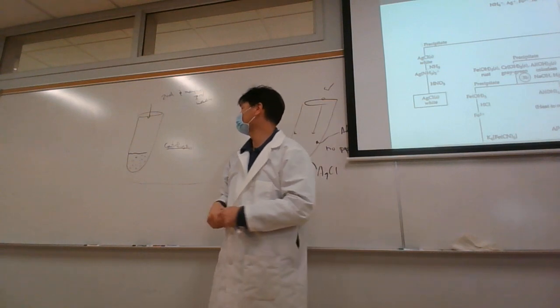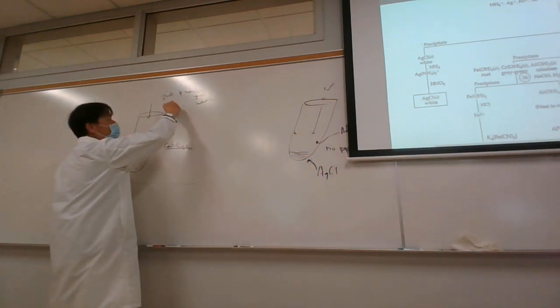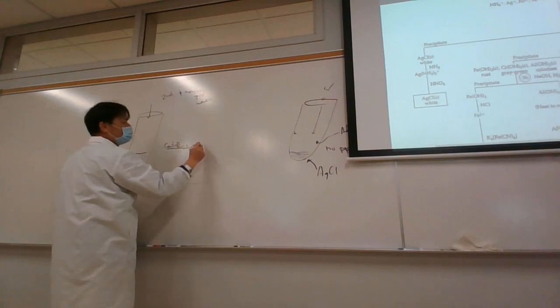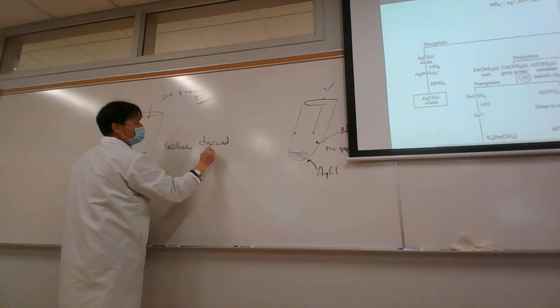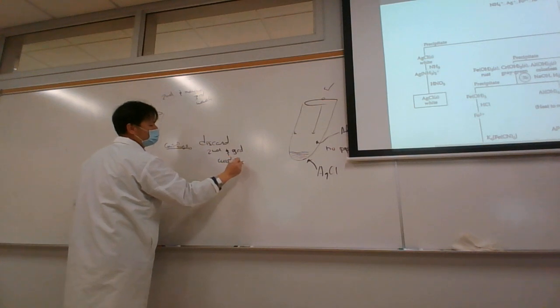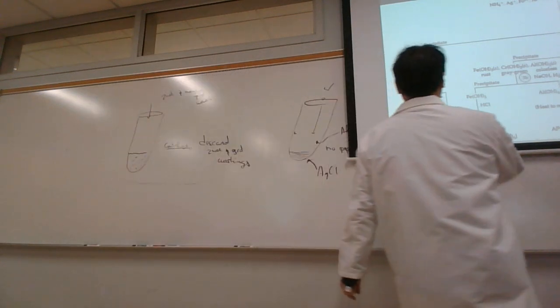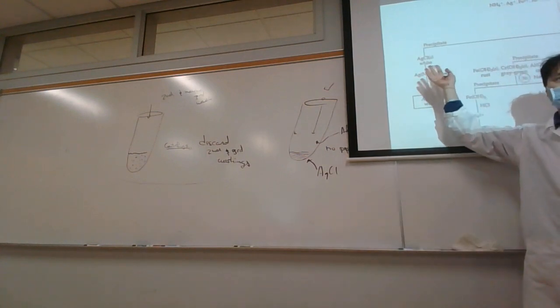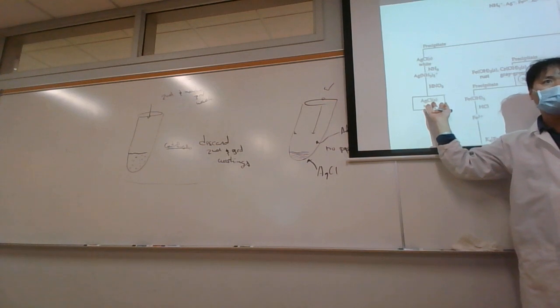The more concentrated the ions are, the easier they are to detect. So second and third wash, discard. Washings, I'll call it. Okay, and so what that means is this precipitate has been thoroughly washed, so we'll get clean results here.